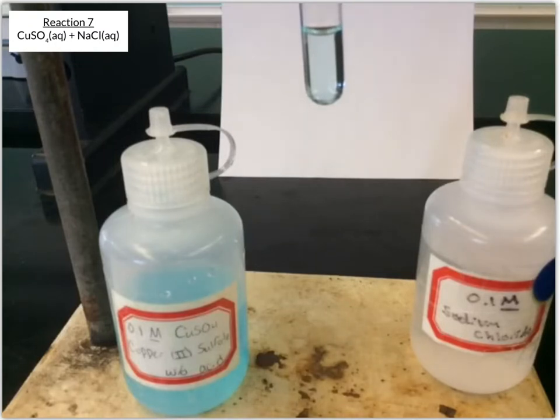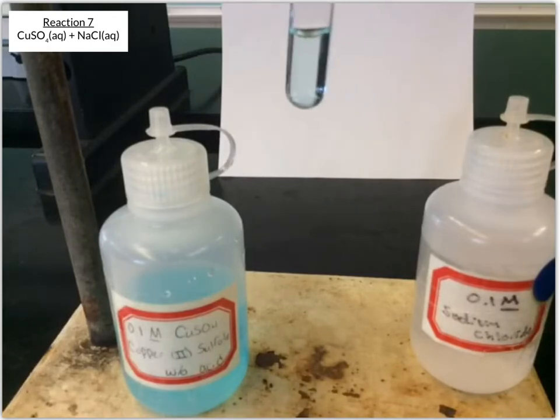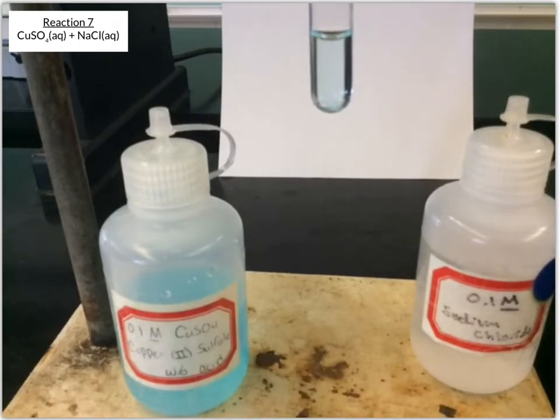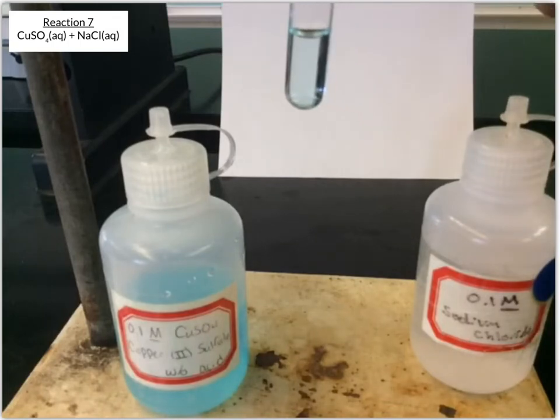Okay, and it looks like it's still a blue solution, but let's go ahead and stir that. Okay, so it doesn't look like anything happened, at least not that we can tell by eye. It's just this clear blue solution. It maybe is a little lighter than it started because it's been diluted, but it doesn't look like it's changed in any way.